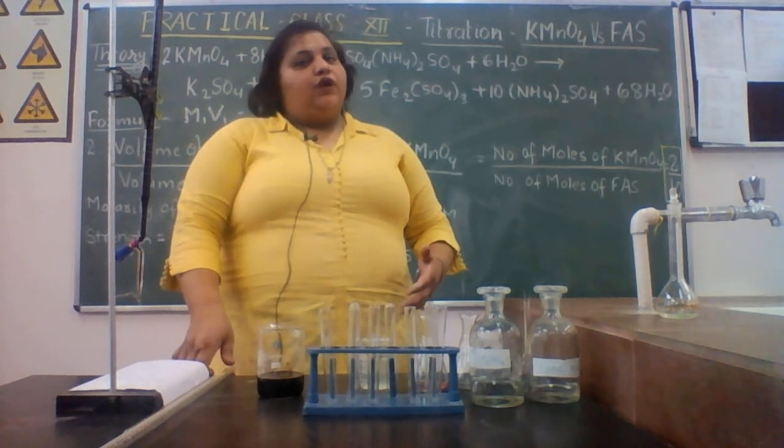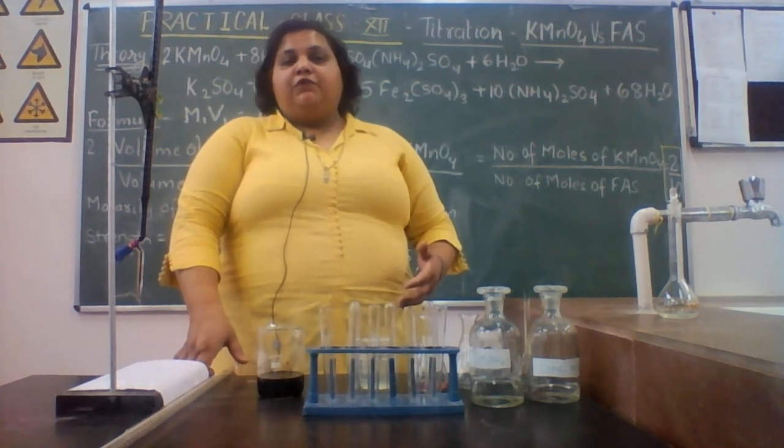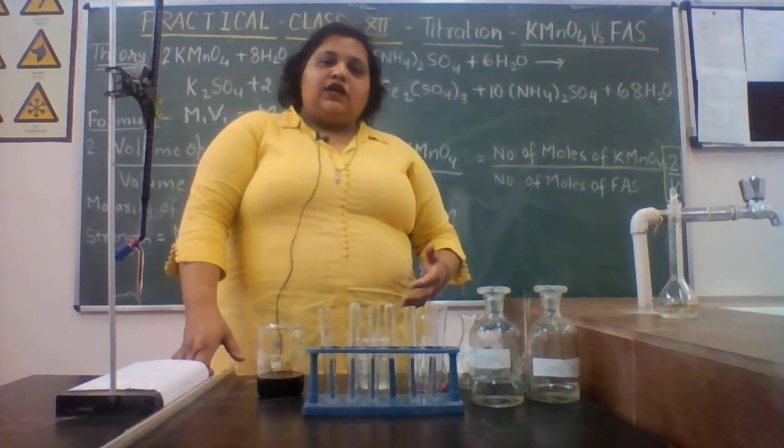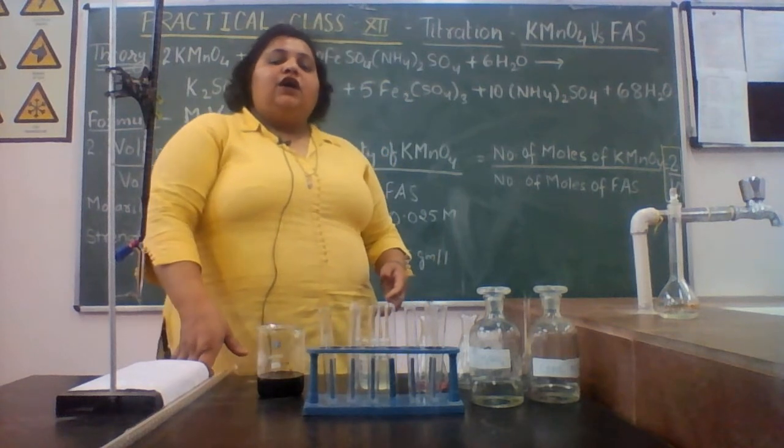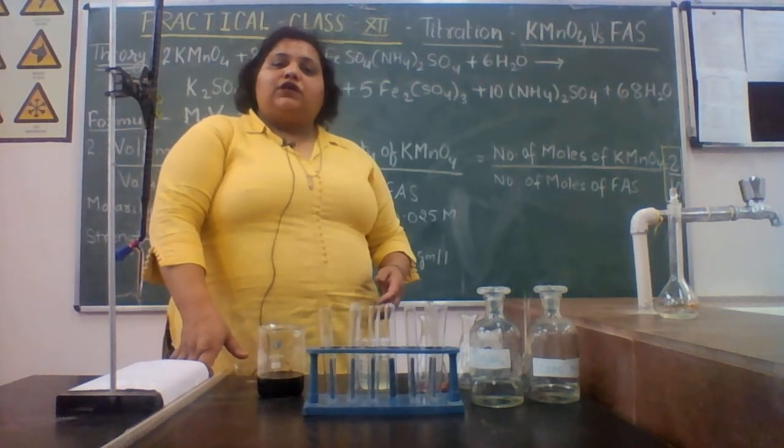Two solutions, I already told you, are in this experiment. The first one is the standard, of which the concentration is known to you, and the second of which you have to find out the concentration.